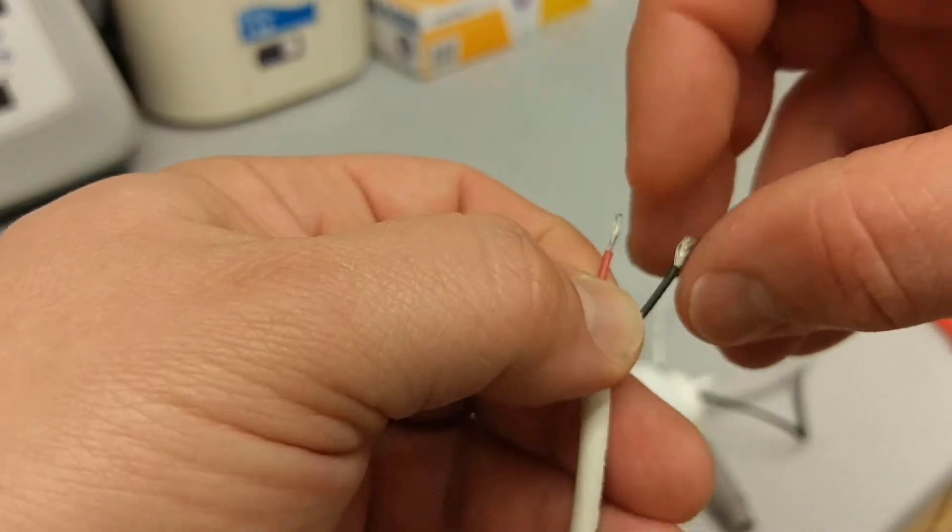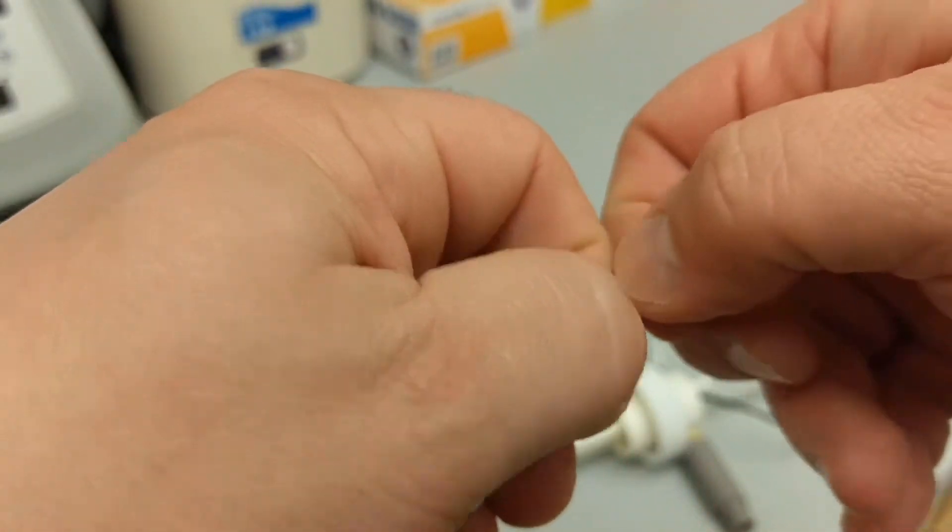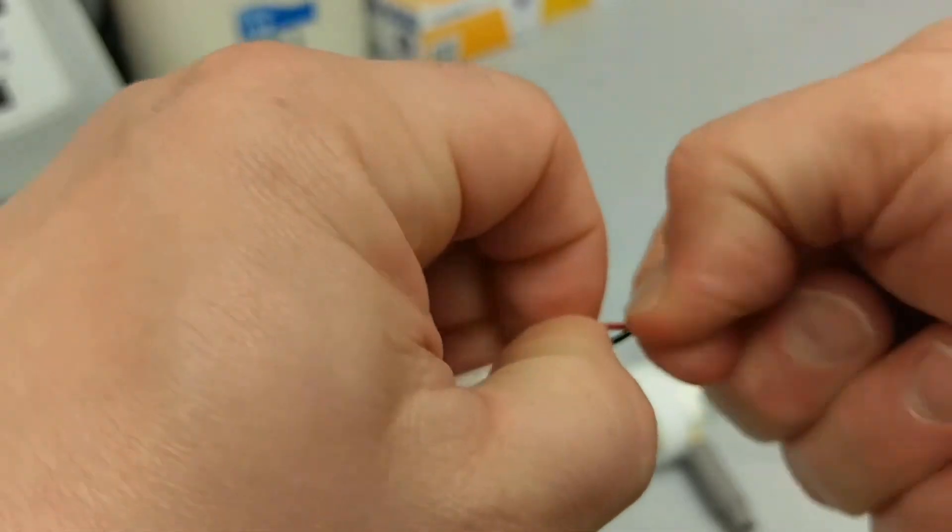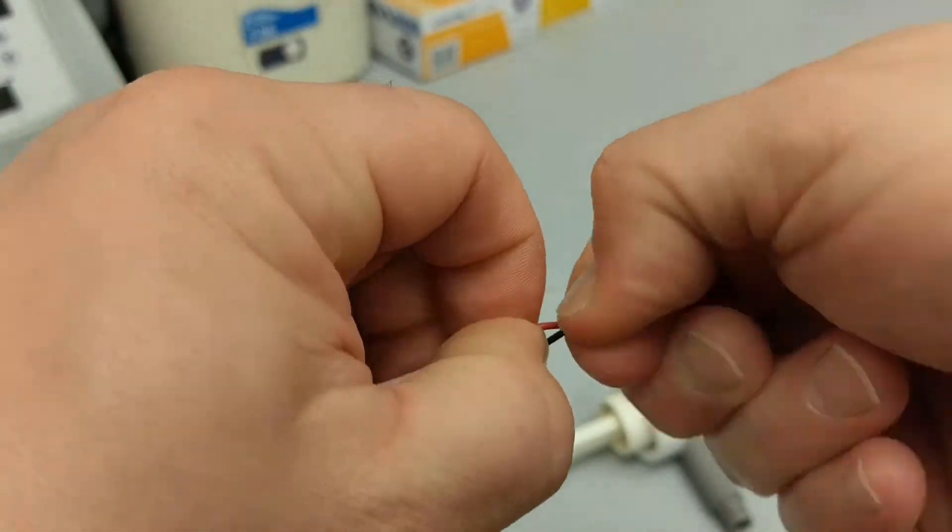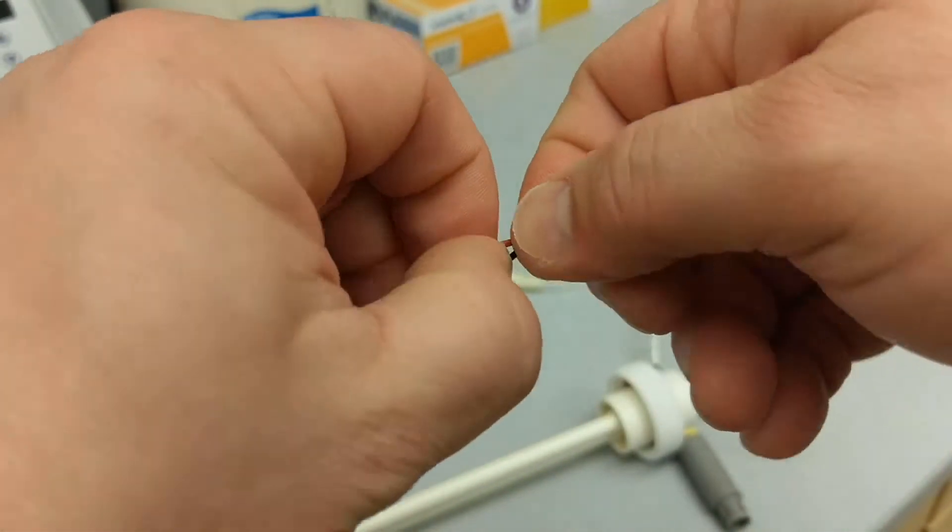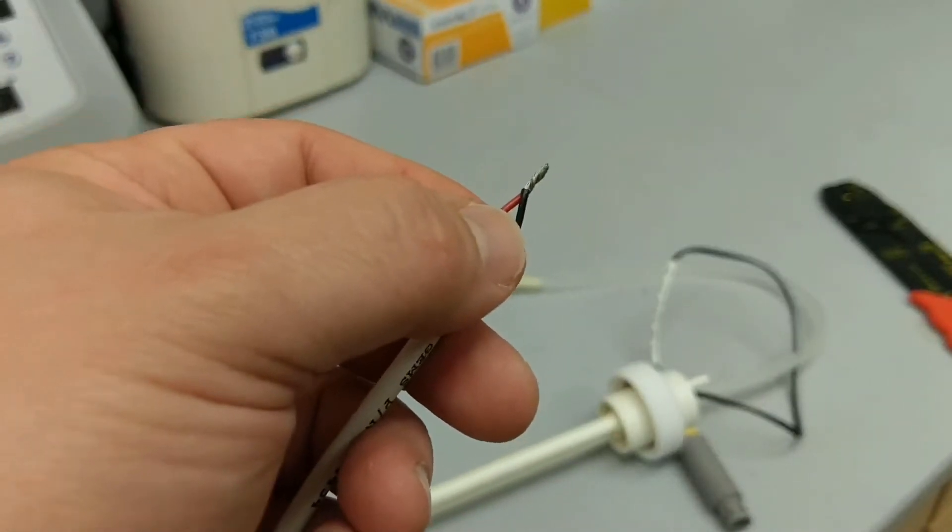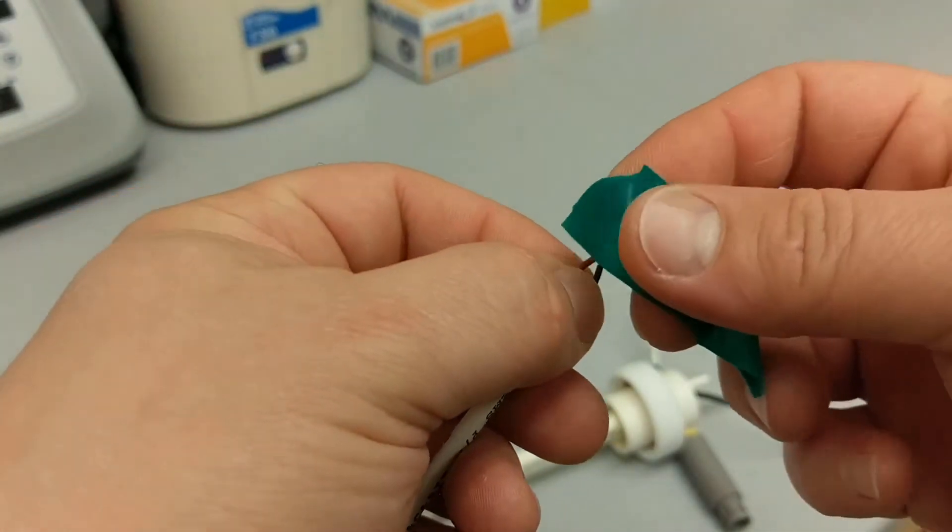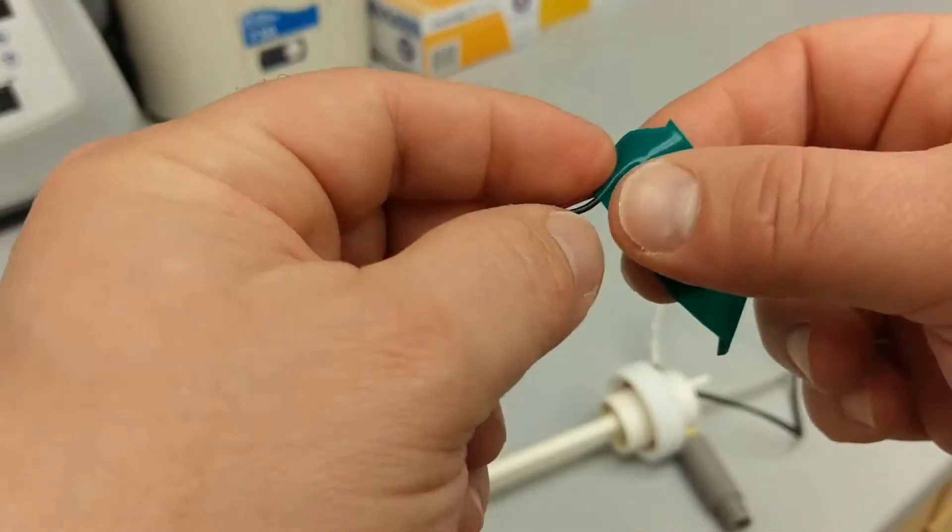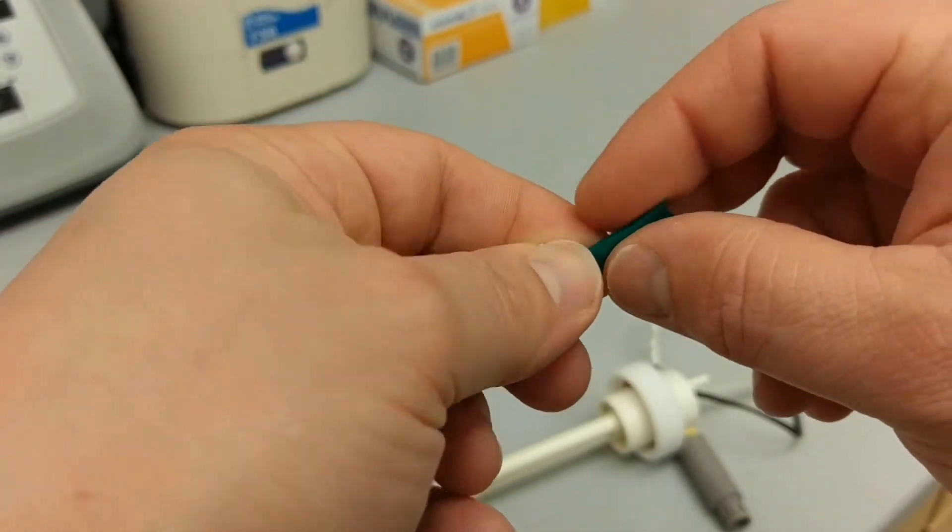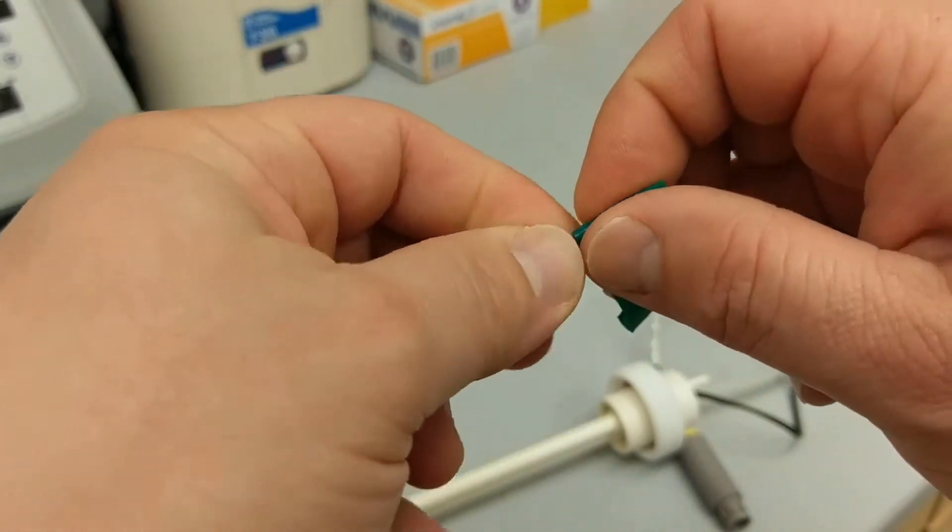And you can artificially complete the circuit just by connecting these two wires, twisting them together, and if you had a little wire cap you could put that on there. Or in my case, I'm just going to use a little bit of electrical tape to tape that connection up.